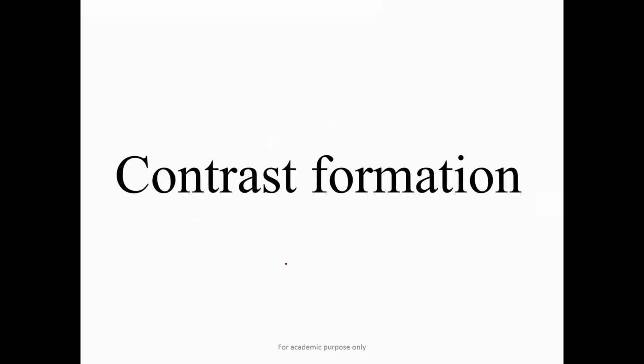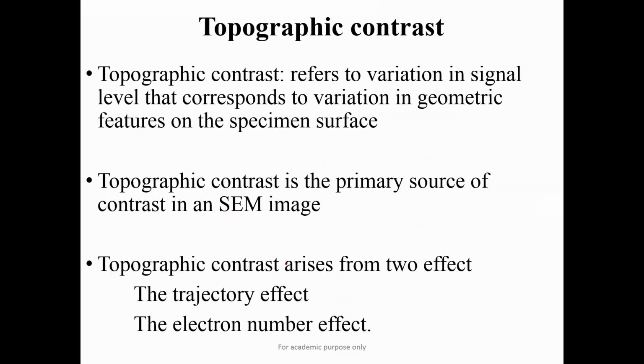Now this is the most important thing, contrast formation. Suppose your sample has some topographical features or some variation. How does the contrast form? You can see this slide because it is in black and white. Suppose I changed the color of the text to light yellow or something, it would be very hard for you to read. That's why I have taken black color, because it makes good contrast.